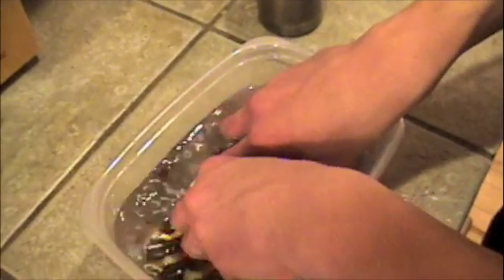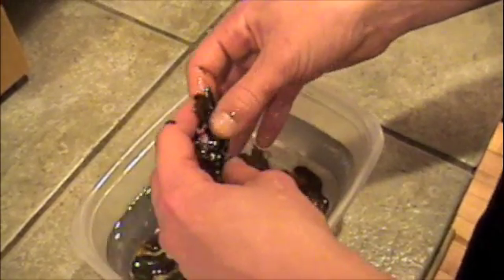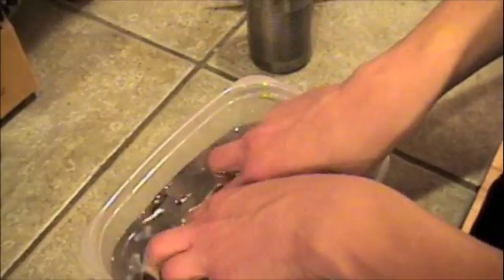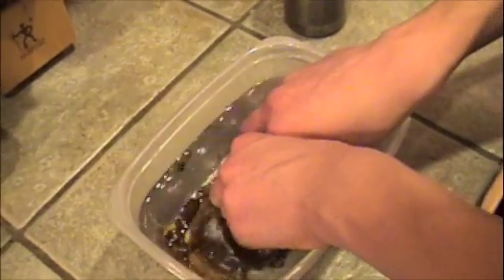This stuff is really liquidy — all these chains are tangled together. Does it stick to your fingers? Yes, it does. It's very sticky and bad smelling. How do you get it off your fingers? I'll figure that out after the camera's off.